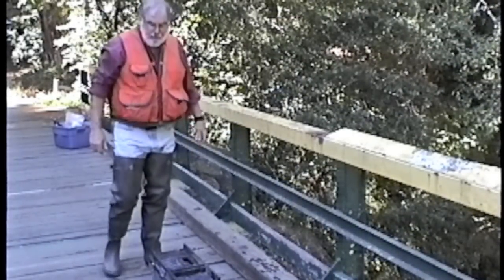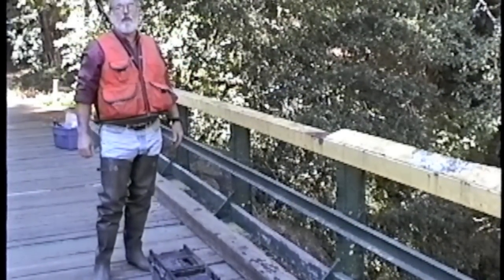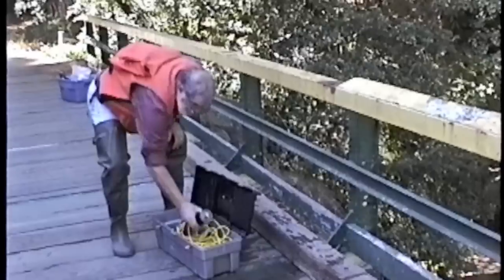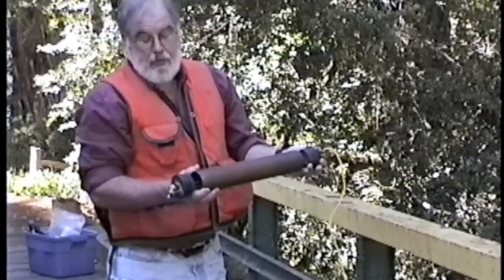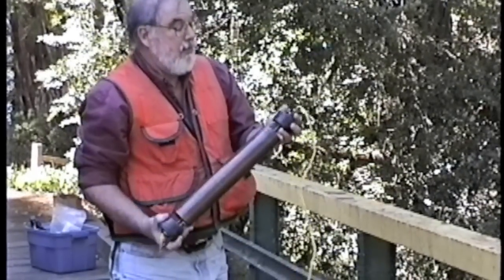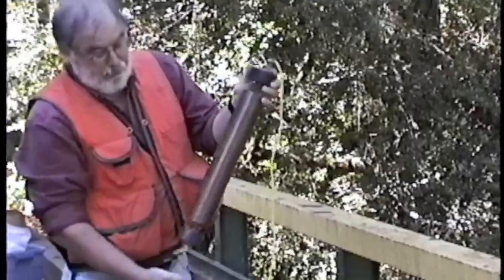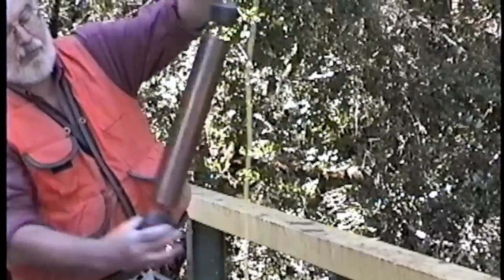I'm going to demonstrate the use of a discrete sampling device known as a Kemmerer water sampler. The device is basically a hollow copper tube with two end seals made out of black rubber, and it is held open by a spring mechanism that slides on a rod that goes through the sampler, thus holding the two ends open to the water.